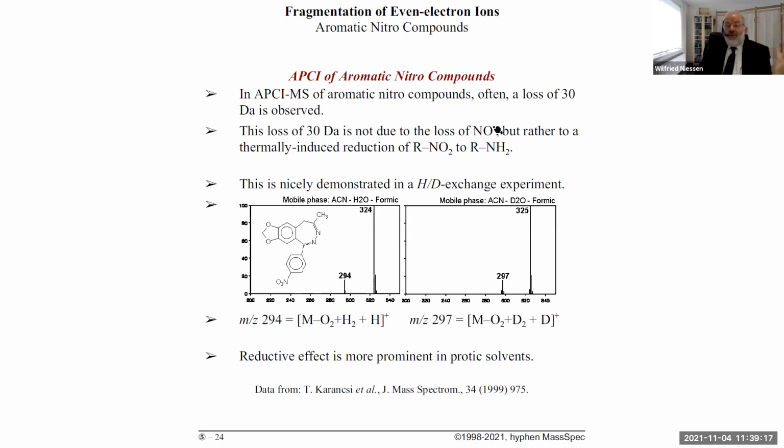So I said to my former colleague, hey, this could be a possibility. Perhaps you should look into that. And he immediately responded, I tried this. Yes, this is what we see. And then there was this Czech group from the Czech Republic who did a very nice experiment to actually demonstrate that the thermally induced reduction also takes place under APCI conditions.